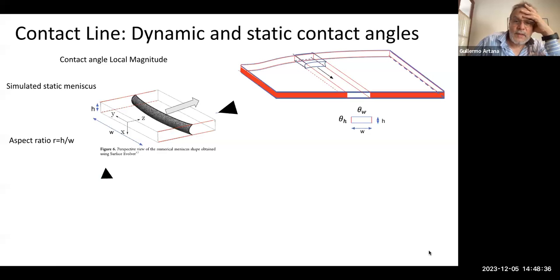Well, if we go now to the problem that we are dealing with, you have one slide here and the other slide here of glass, and you have the laterals here that are of different materials. First, from a static point of view, you may have a solution for the surface of the meniscus that is being formed. This is numerical. It is not quite difficult to incorporate the different materials here.